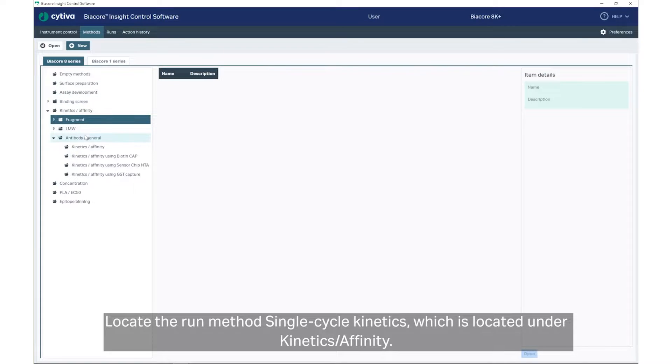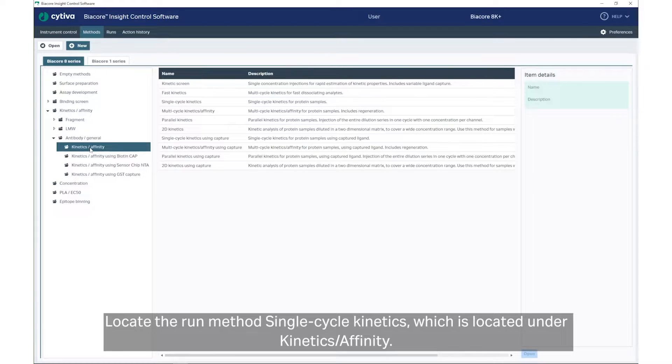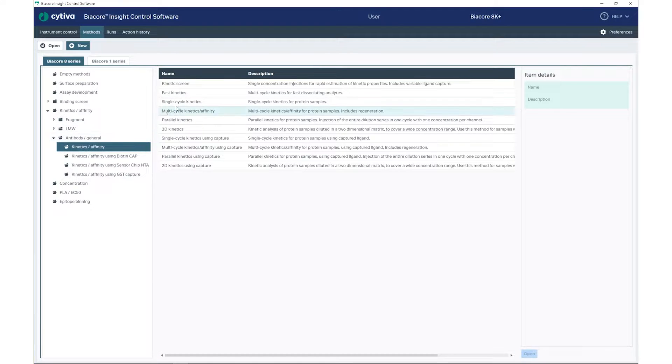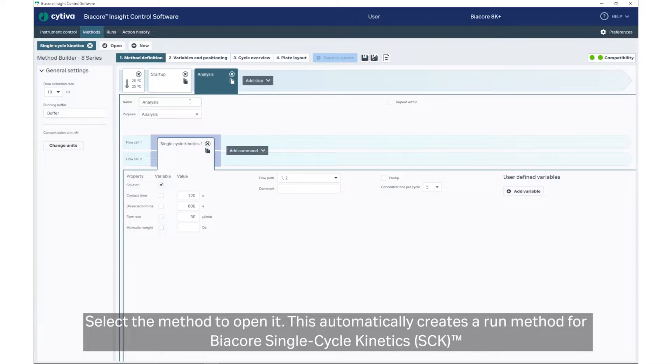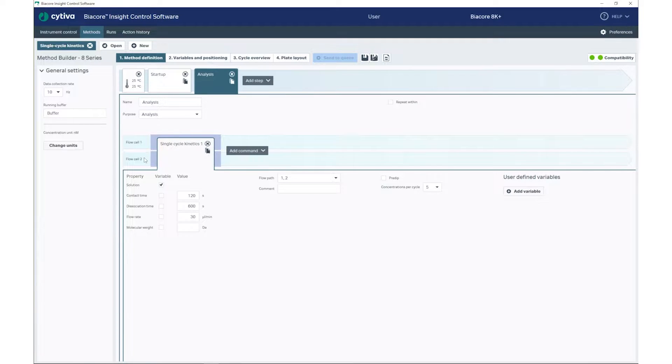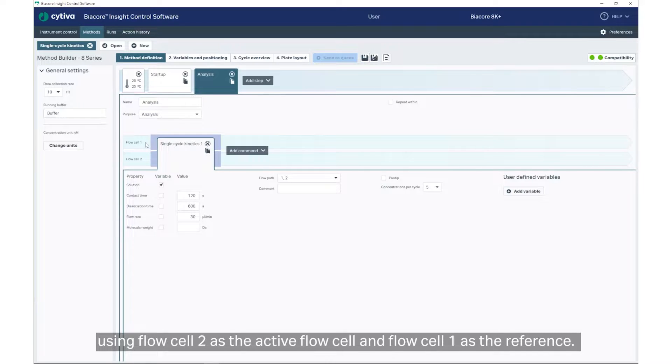Locate the run method, Single Cycle Kinetics, which is located under Kinetics/Affinity. Select the method to open it. This automatically creates a run method for Biacore Single Cycle Kinetics using FlowCell 2 as the active FlowCell and FlowCell 1 as the reference.